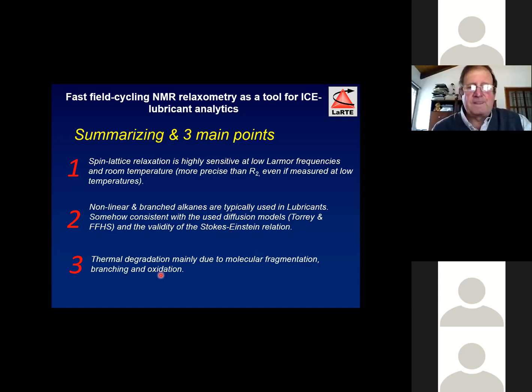And the third point is that thermal degradation is mainly due to molecular fragmentation, branching, and oxidation of the molecules in the oil. Of course, maybe the novelty here is not so high because with other techniques, this was already observed, but the novelty here is that we can see the change in the NMR relaxometry, and complementing with other techniques, then we can explain.